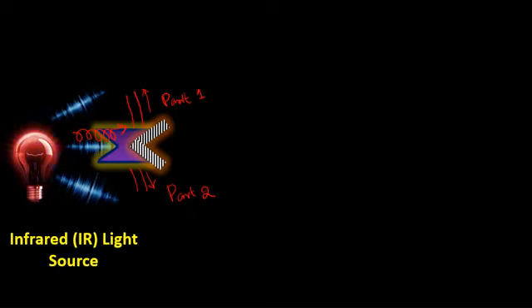Student, keep in mind the optical chopper works on modulation of frequency, and on the basis of frequency this device divides the infrared radiation into two equal parts, part 1 and part 2. And when the optical chopper divides the infrared radiation into two parts, these radiations then move in the forward direction toward another device known as a monochromator.